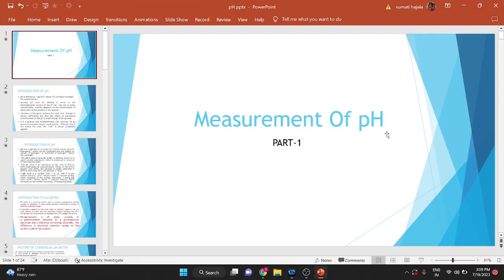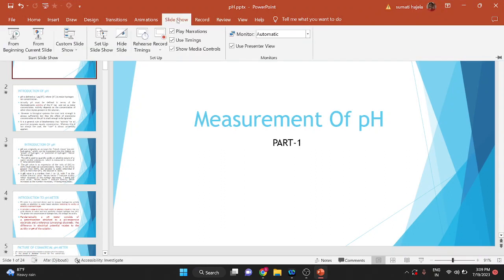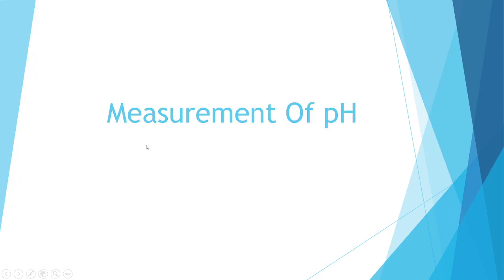Dear students, today I am going to tell you about measurement of pH by pH meter. So this is the topic, measurement of pH. This is part 1, and now the introduction of pH first.